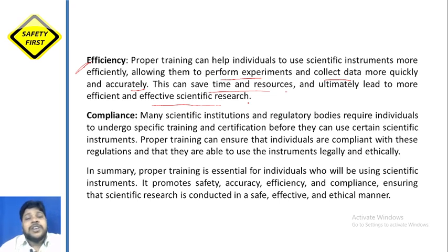So it is very important to provide proper training to individuals who are working in such laboratories. And from a student's point of view, I'm saying whenever you are working in any environment, in any lab, you should be well aware of the importance of training. Training could be helpful for you as well as the whole project you are handling.